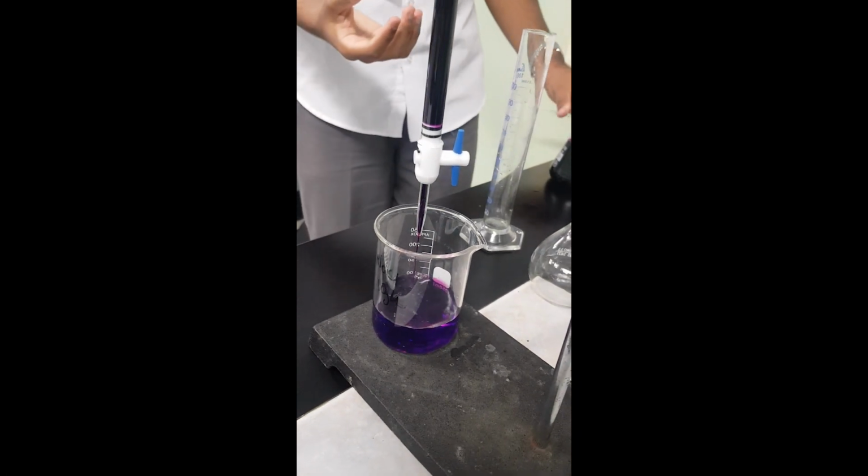We start off by setting up a retort stand with a burette holder. I had to use a clamp under my burette holder because it would not stay in place and there was no other holder available, so I decided to make do with what I had. Place the burette in the holder and place it under a waste beaker. Start off by rinsing the burette twice with distilled water and then once with potassium permanganate using a funnel.